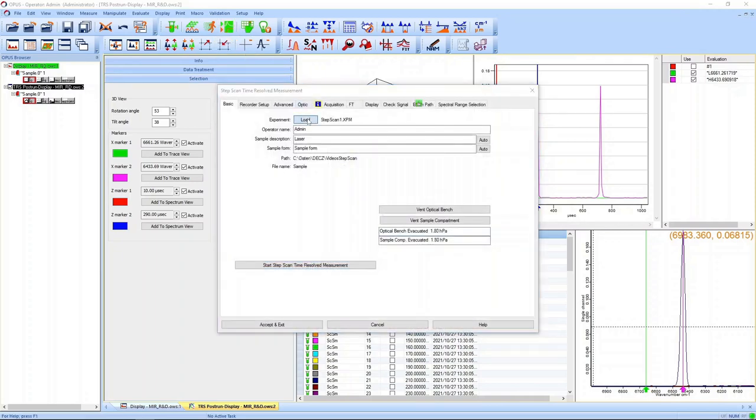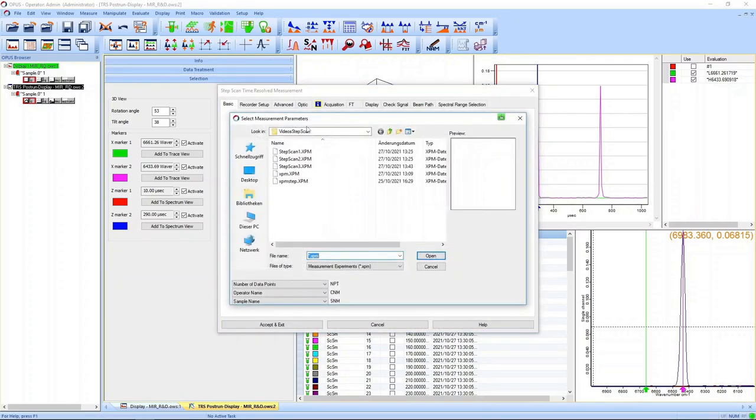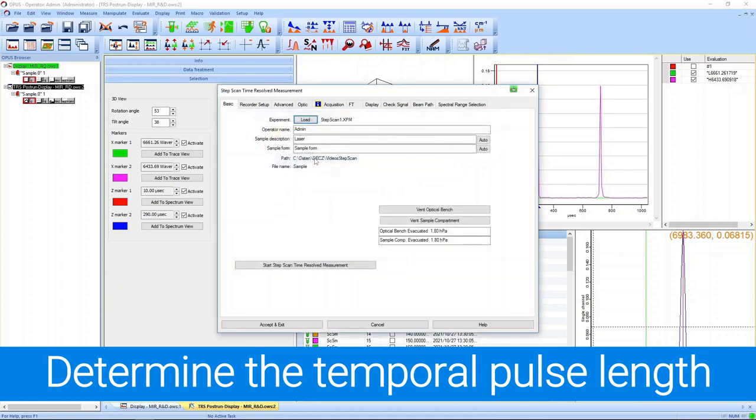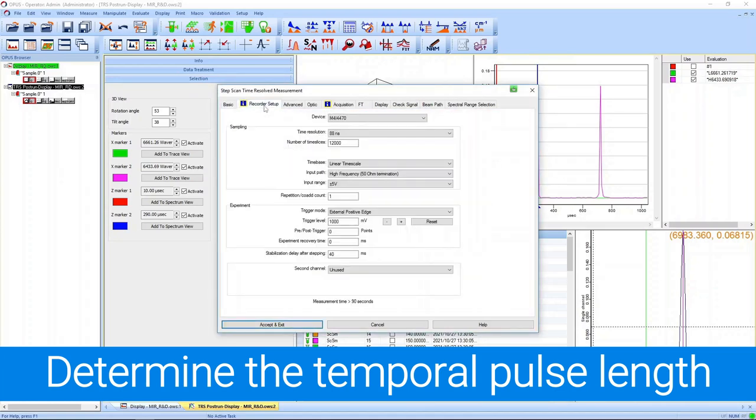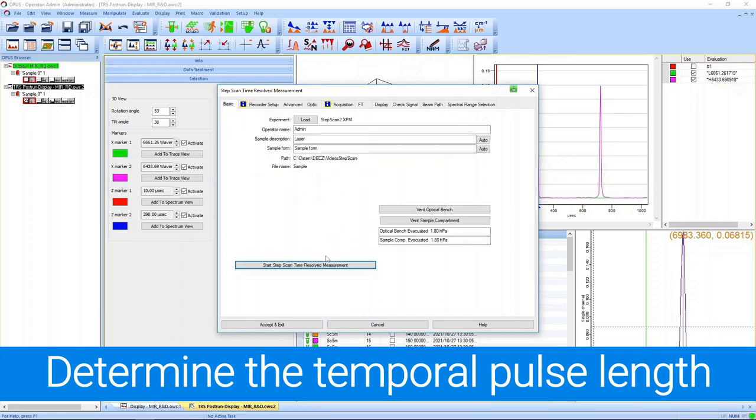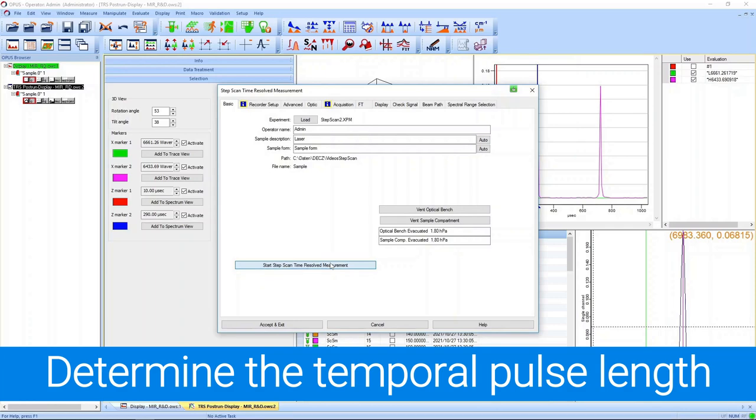We do that by using a higher temporal resolution. In the recorder setup we use a higher temporal resolution while making sure we use the same overall time window. We keep the 16 wavenumber resolution, so the measurement time is again around a few minutes. We accelerate this again.